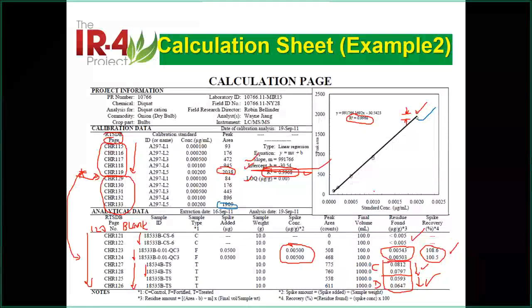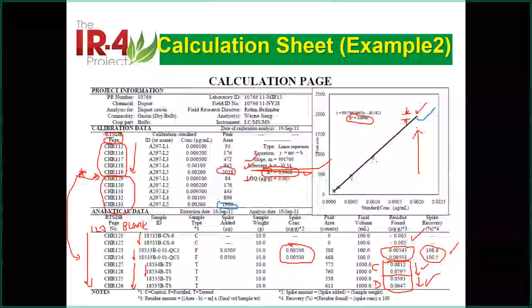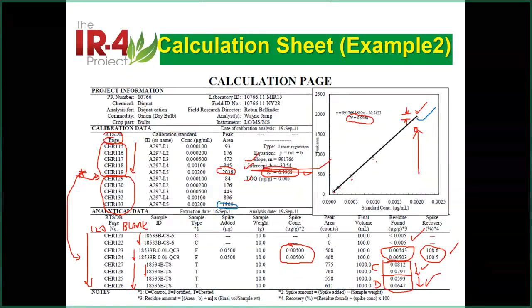And the tricky thing is it always depends on the last point. So if the last point is close, you will get this R squared value of 0.99 easily. If the last point is not good, even if the rest of them are really good, you will get a very bad R squared value.